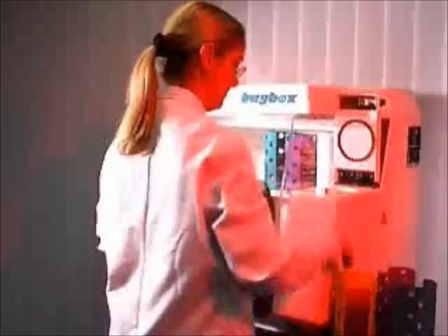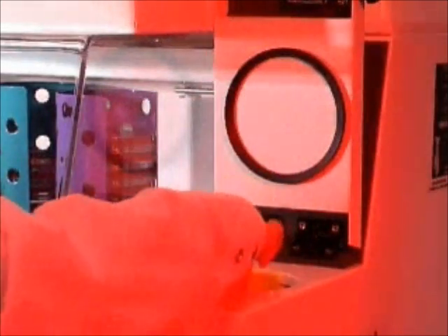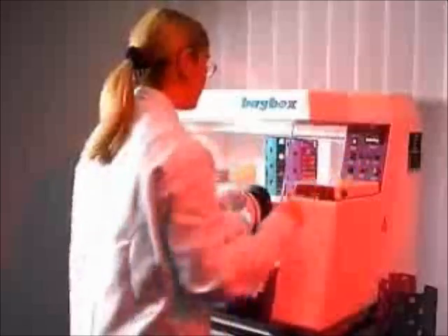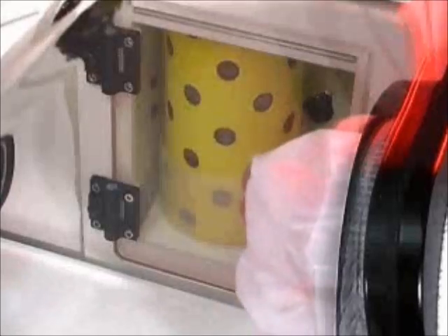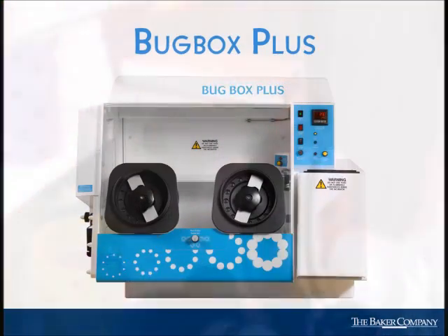To operate the ultra-compact Bug Box interlock, simply lower one of our unique colored petri tubes into the top loading compartment and press the purge button. This rapid interlock facilitates the transfer of up to 10 plates in just 15 seconds. A convenient swing-out door provides a simple means to easily take work into and out of the chamber.